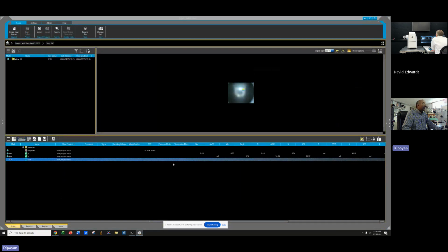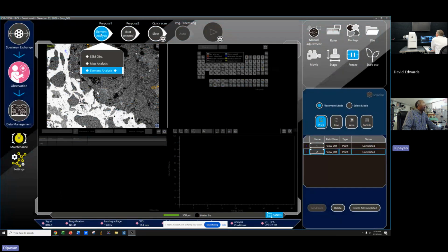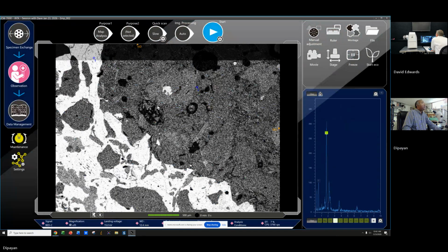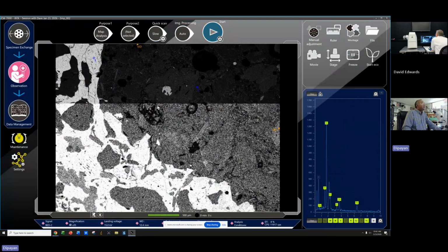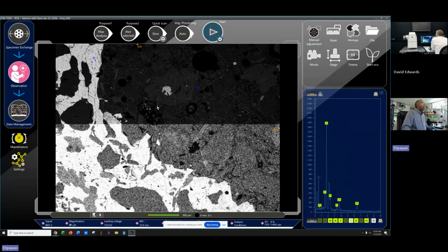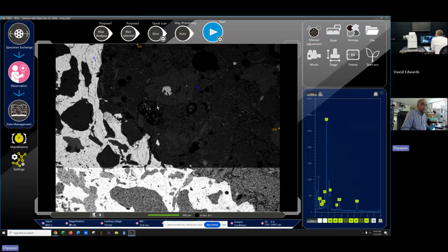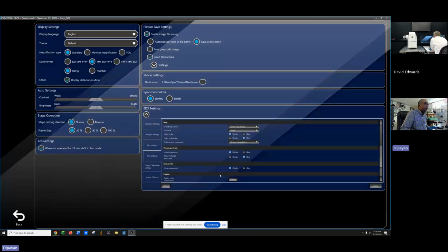Let's close that. So now if I go to map, same one, we can do map. Everything is too dark here, but that's okay. So now, do I need to play with the condition? I don't do anything now, right? Because we already chose my condition there. Yeah, you're all set.